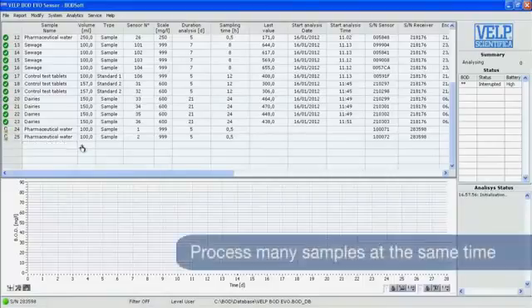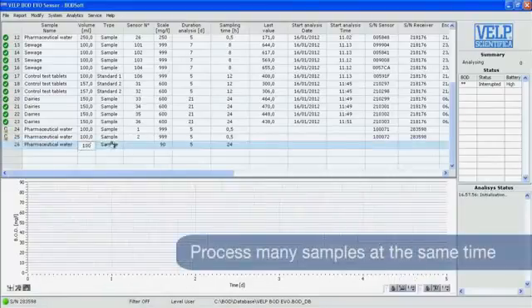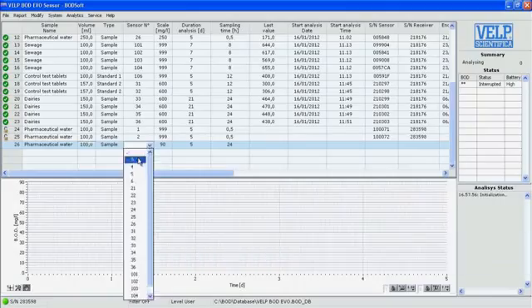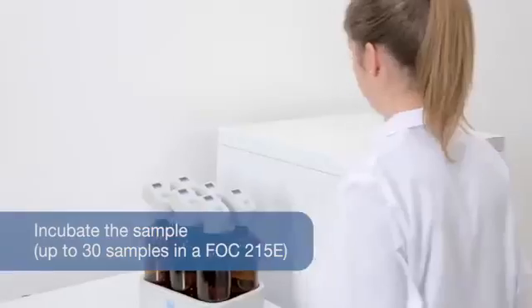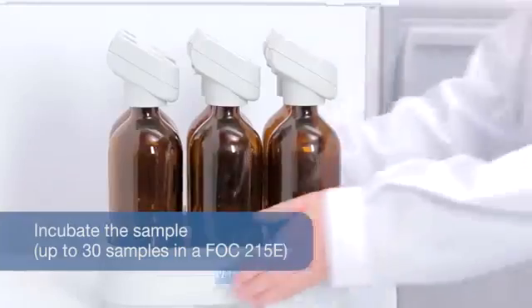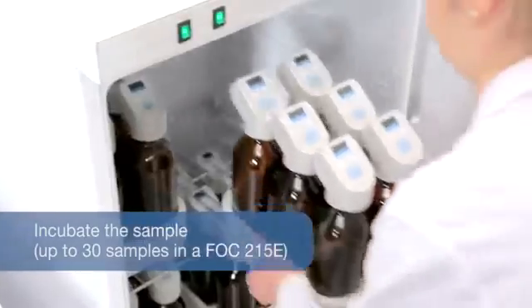Once having programmed the sensor through the BODSoft, the samples need to be incubated and gently stirred. Up to six bottles can be loaded into the VELP stirring station with maximum convenience and simple handling.